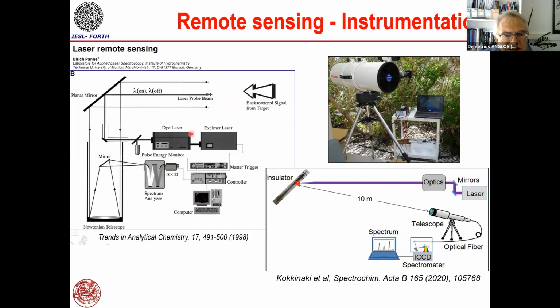A variant of this, which does not really contain lasers, is the satellite imaging instruments, of which there are plenty nowadays, and they do environmental work. They are tuned to particular molecular transitions and measure greenhouse gases and others.